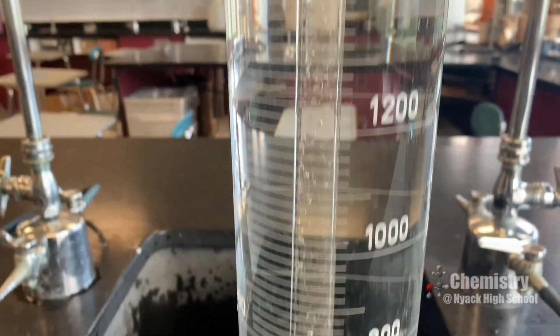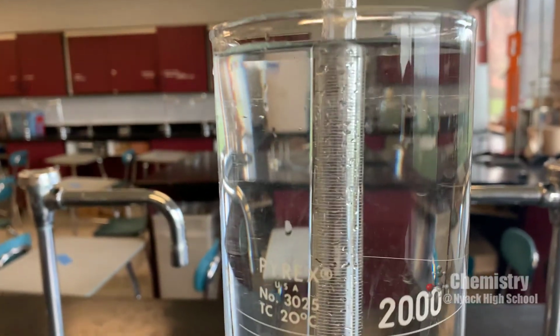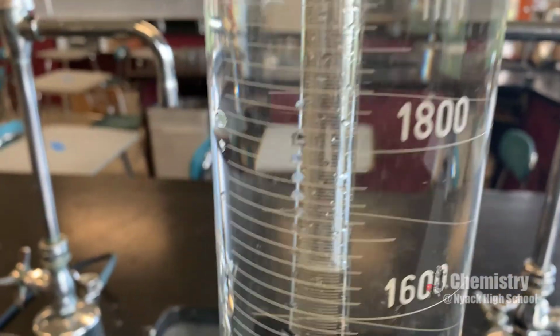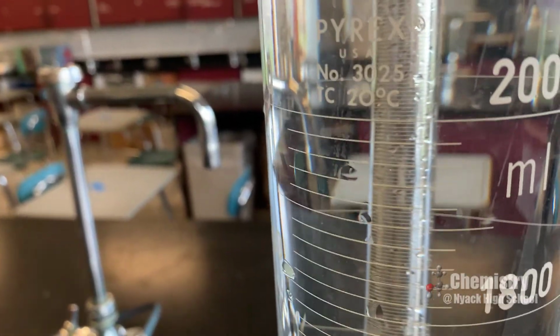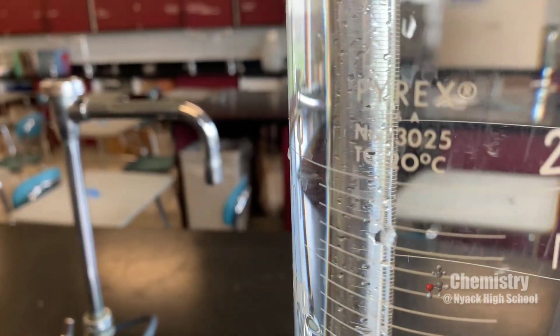Notice that the gas is still trapped and submerged inside of the water that's inside of the graduated cylinder. I will leave it inside the water for a period of time to allow the temperature of the water to equilibrate with the temperature of the gas inside of the eudiometer.